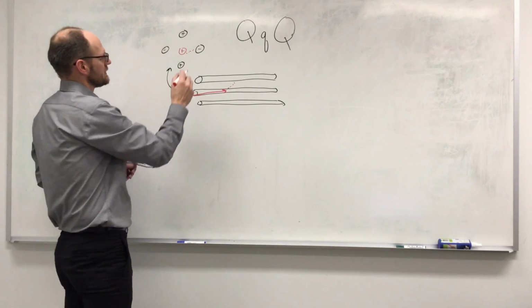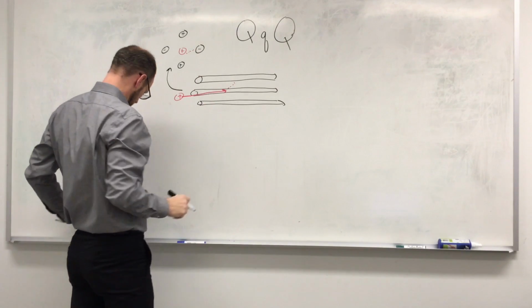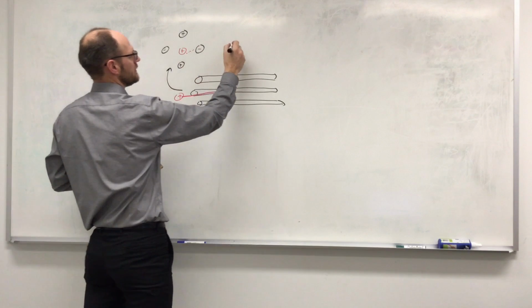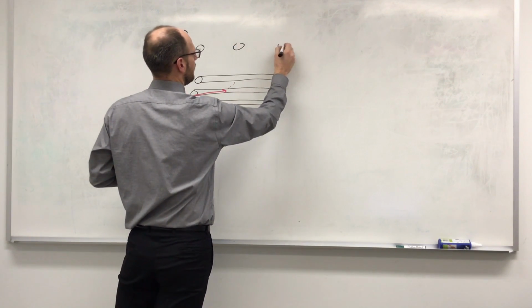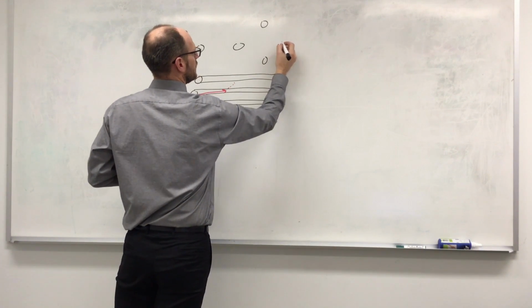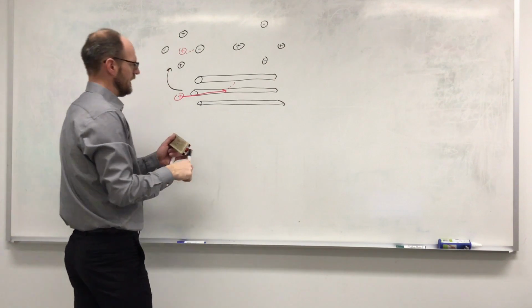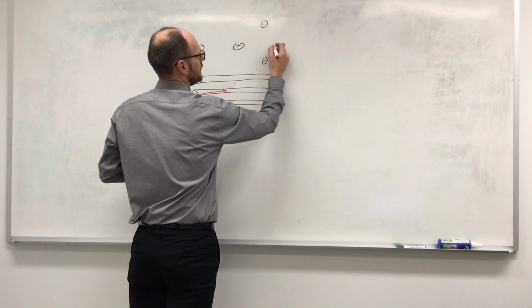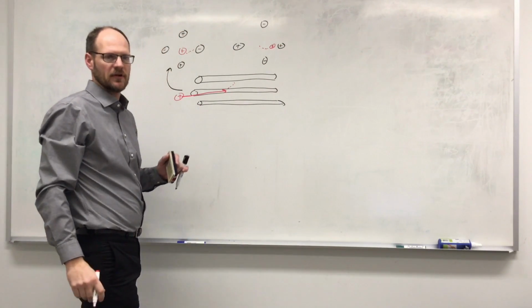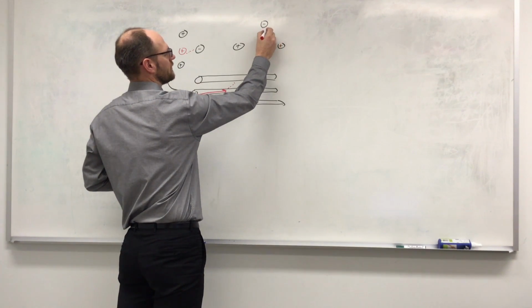But what happens is, the electronics in the instrument are precisely timed such that when the ion gets close to that rod, the polarity switches. And then the ion that had flown to here is all of a sudden repelled because it's coming close to a like charge. And so it flies off towards the other rod.